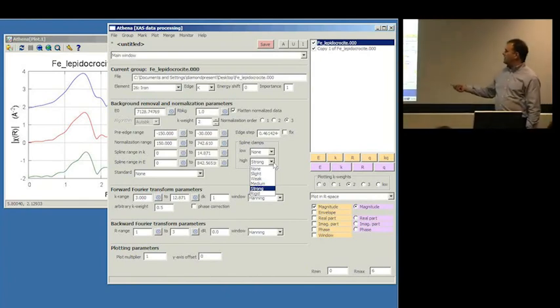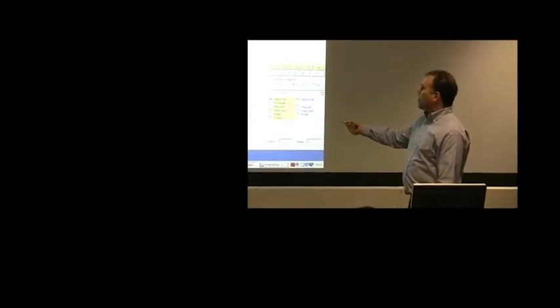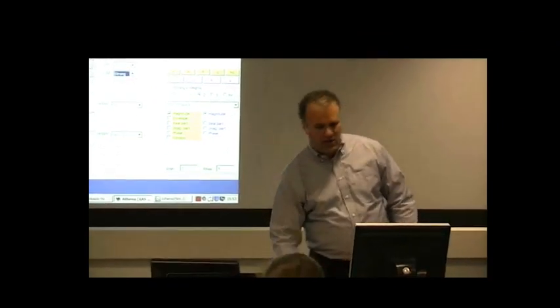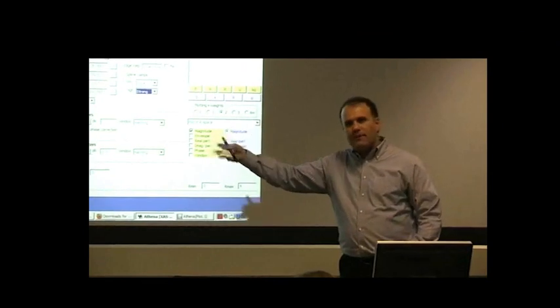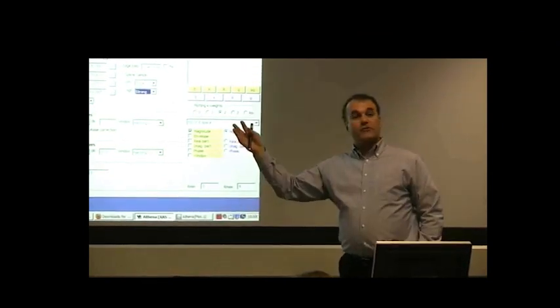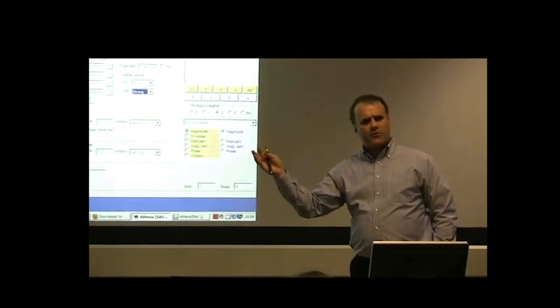The words are quite good enough. Strong turns out to be the good choice for the high-end clamp, and usually you want no clamp at all at the beginning of the data, where nominally you have the same problem, but it's less of a concern for a number of reasons. So, was that an adequate explanation?